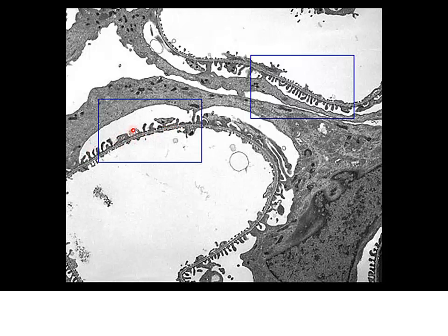And here we can see the pedicels or secondary processes of our podocytes with their filtration slits and filtration membranes between. Here you can see a secondary process or a pedicel actually touching down, and this is a primary process of a podocyte, and here's the nucleus of that associated podocyte, and you can see more of those pedicels attaching downward.